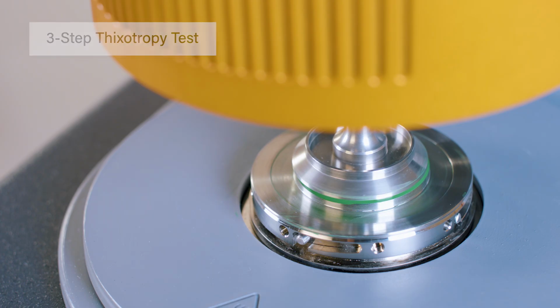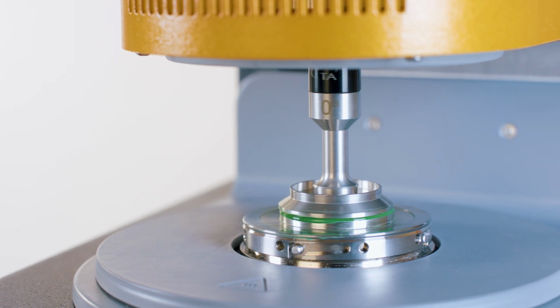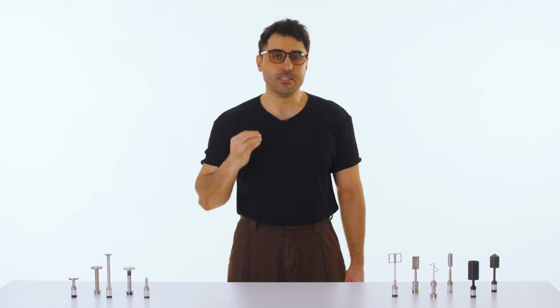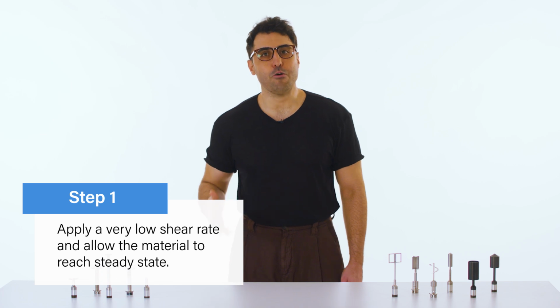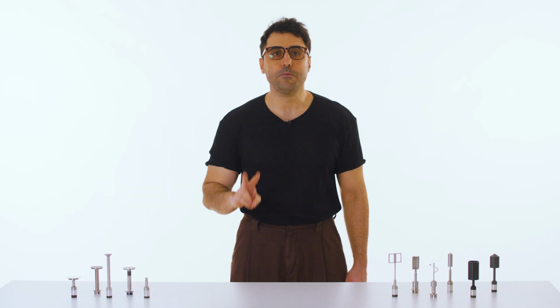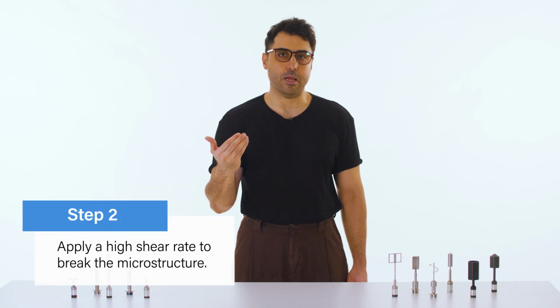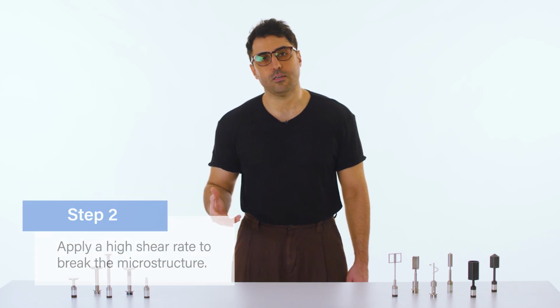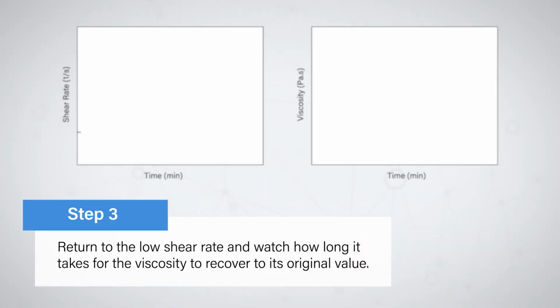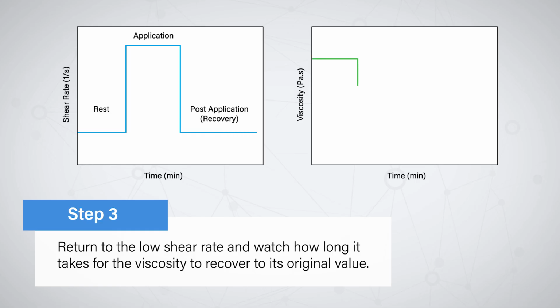You can run this test in shear or in oscillation. I prefer oscillation. Let me show you why. In shear, step 1, apply a very low shear rate and allow the material to reach a steady state. Step 2, apply a high shear rate to break the microstructure. Step 3, return to the low shear rate and watch how long it takes for the viscosity to recover to its original value. That recovery time is your thixotropy time.